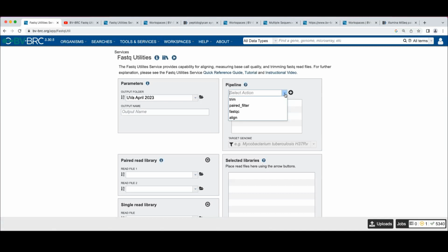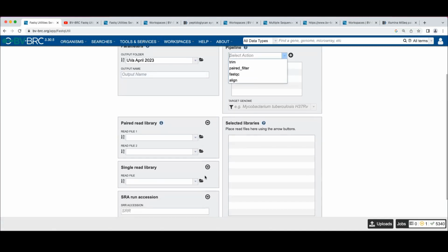And you won't know that until the job fails on you, because you would submit it as a single read file. And then if it failed on you, what should you do? Contact us through the green action bar. Okay. Sounds like something out of the Marvel universe, the action bar. So you report the job to us, and then we'd look at it and say, oh, you need to run this on it.